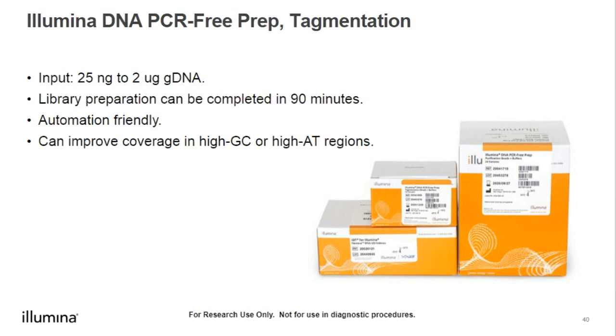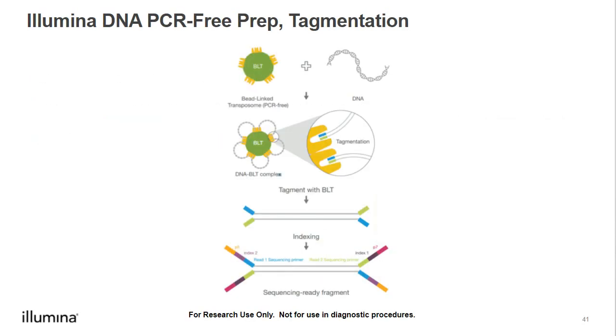With this, we start by mixing our input DNA again with PCR-free bead-linked transposomes, which tagment the DNA. We then ligate single-stranded adapters, which complete the adapter sequences and uniquely index the samples. We purify the ligated products, and our libraries are ready for quantification and sequencing.